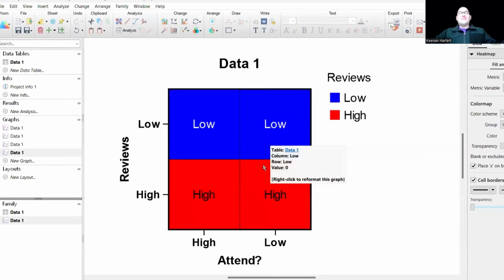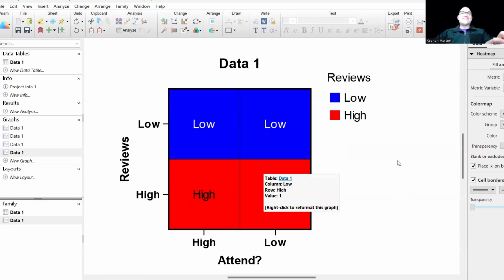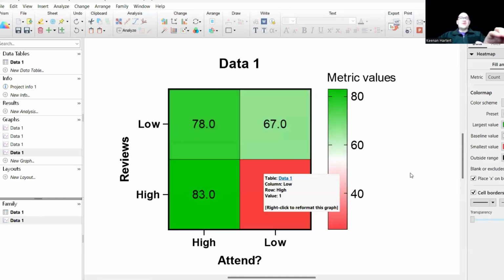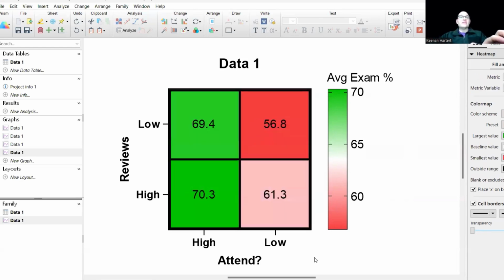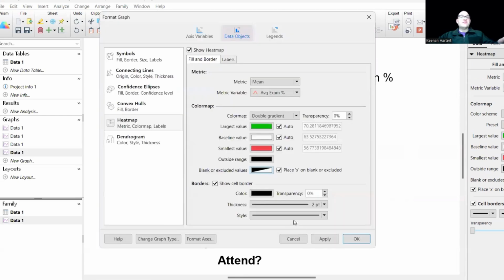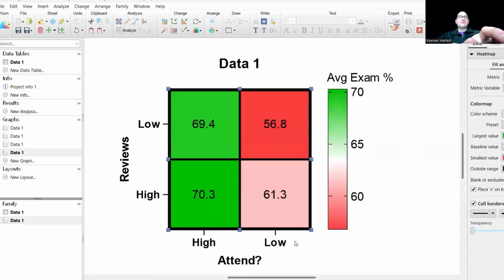And then, yeah, that's just variables on variables. We kind of know that. So in this case, using this to kind of summarize matrices into numbers that we can actually utilize is going to be really helpful. And if I want to go a little deeper than this, and actually here, I want to keep my cell borders.